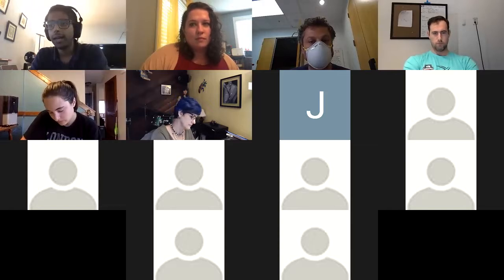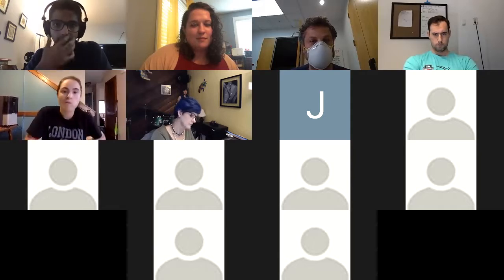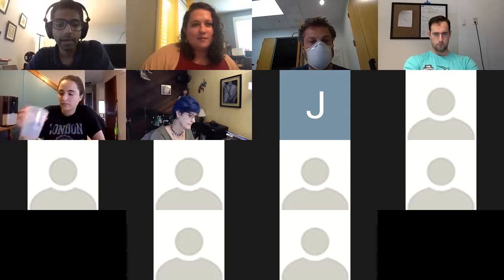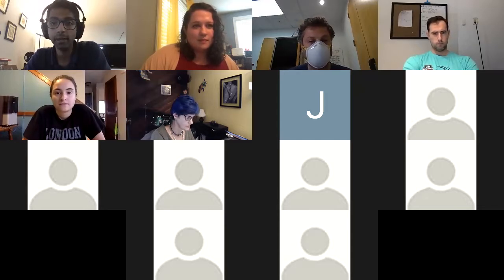And then once you get your score, there's a cutoff determined by the facility directors, based typically on how many hours there are in a given week and how many staff members we have and our ability to support projects. And then if you meet those criteria and your proposal gets accepted, you can use all the facilities at NCEM or at the Molecular Foundry for free. It's completely free of charge, and you get access to the Berkeley Lab staff and their expertise, which is oftentimes very helpful.